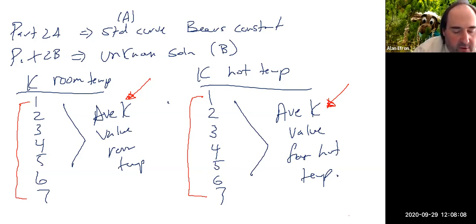Question on the goals here of the experiment. It is a lot of Excel work usually when you do this. And again, like I said, I probably would try to use Excel to get yourself set up and get it to calculate, because you could do all 7 of them really quickly by dragging down, right? As long as you have the right information and the spreadsheet set up correctly. Again, you could do them all by hand if you want to. But I would probably recommend at least doing 1 by hand or 2, just to double check and make sure Excel is calculating it correctly.